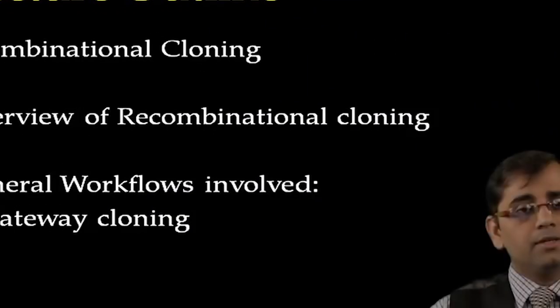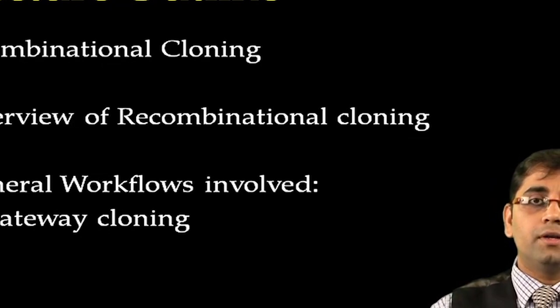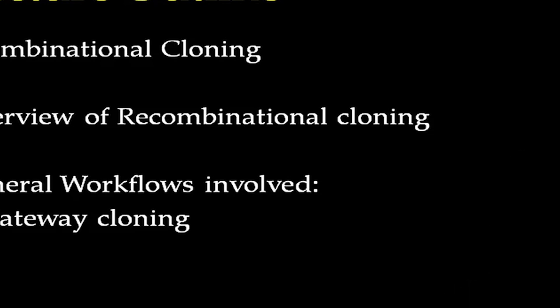Researchers have started creating a large collection of cDNA libraries using recombinational cloning. Recombinational cloning allows a rapid transfer of DNA fragments from one vector to another in a very short time. In today's lecture, we will talk about the general workflows involved in performing recombinational cloning. Let's first discuss recombinational cloning.